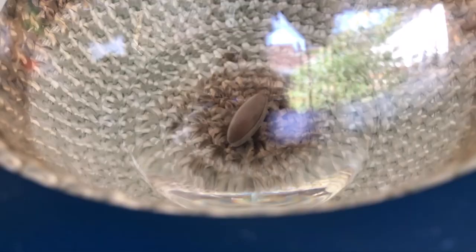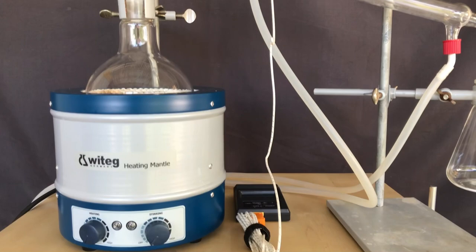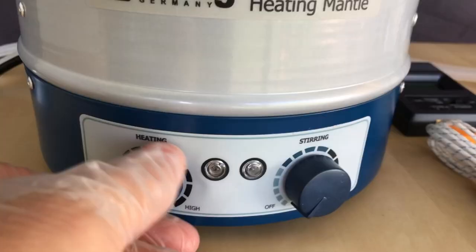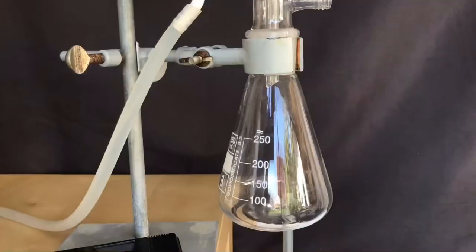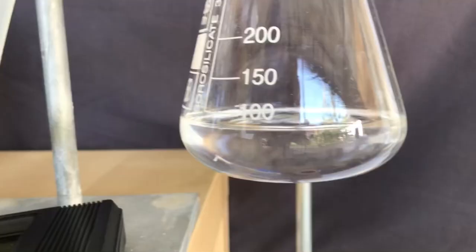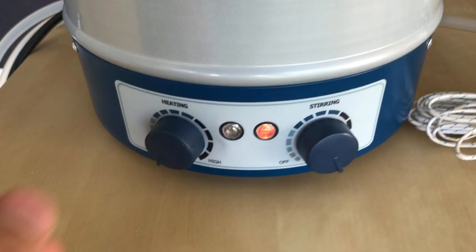Next, a simple distillation was performed to further increase the purity. On the left is the heating mantle and distillation flask, followed by a distillation bridge and collection flask. Heating and stirring were turned back on, and we waited for the liquid to begin to boil. A beautiful vapor front climbed up the flask. The first collection flask was switched out, as the first portion that passed over might have been leftover ethanol. The fraction coming over between 130 and 150 degrees Celsius was collected. When we reached 150 degrees Celsius, the heating mantle was turned off.